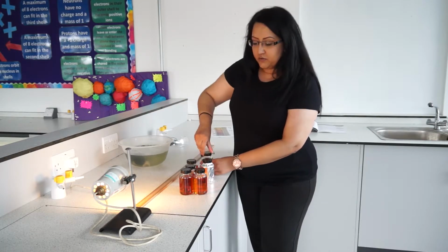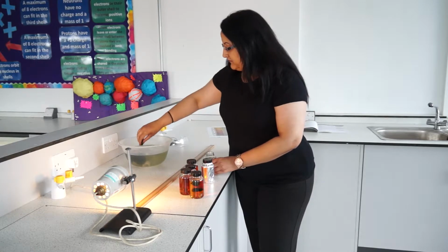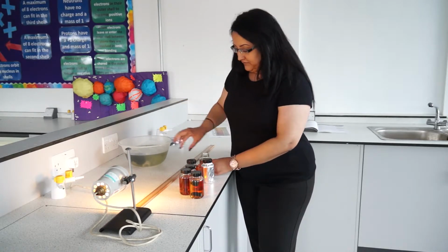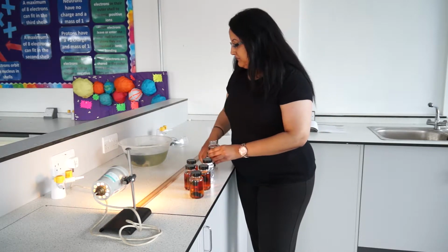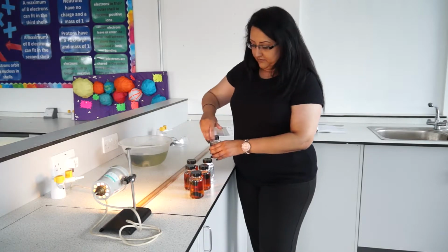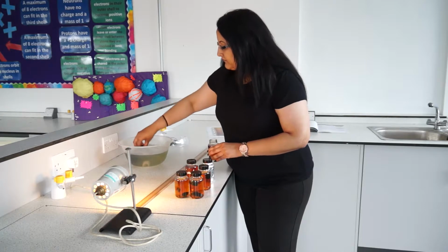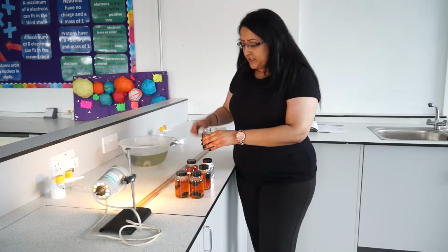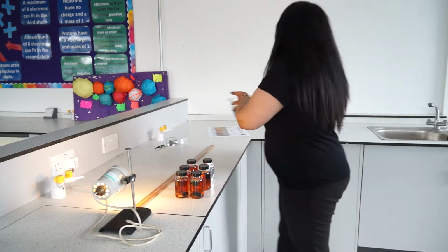Just squeeze off the excess water. You must keep these in water when you're not using them. Okay, so we're done with that. We'll just put this to the side.